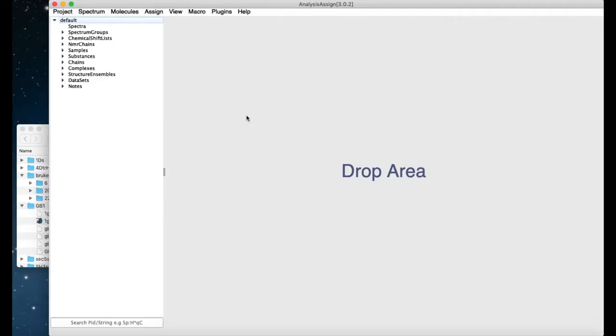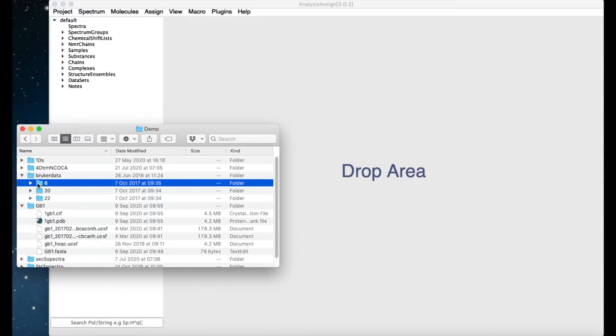To get started, you can read in your spectrum either by going to Spectrum and then Load Spectra, or you can just go to your file browser and take hold of a spectrum. In the case of Bruker data, a whole folder if you like, and drag it into the program.